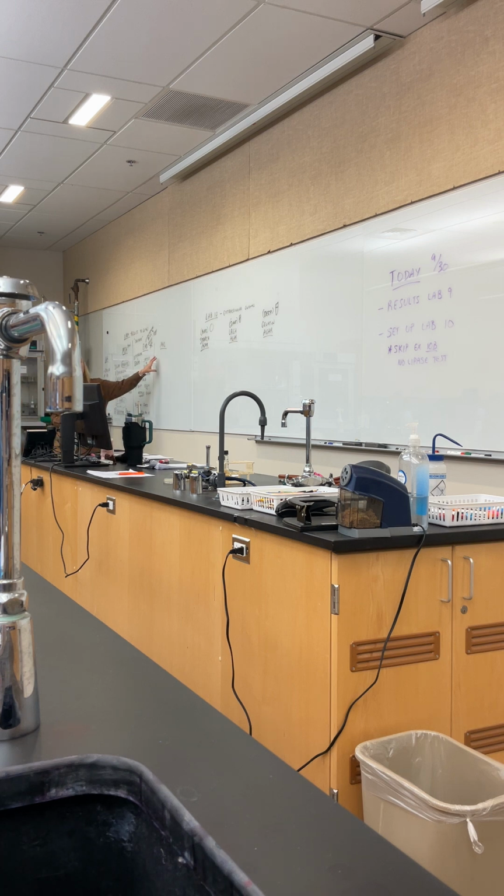Okay, the next one is MacConkey, and that's going to be kind of a violet, pinkish color. MacConkey is always set up with urine cultures. If you work in a lab and somebody has signs of a UTI, what's a UTI? Urinary tract infection. Excellent.